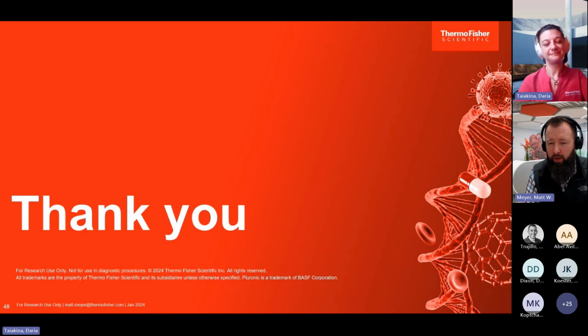Yeah, it's another great question. Droplet spacing is a relatively unique and new feature that basically allows you to optimize your fanning into your tubes. If you have cells that are very closely spaced together, they have the same charge, so they can repel each other. We want to keep our side streams clean so we can get very good recovery. If these cells or drops are very close together, those will actually be aborted, and so you can reduce the amount of fanning.